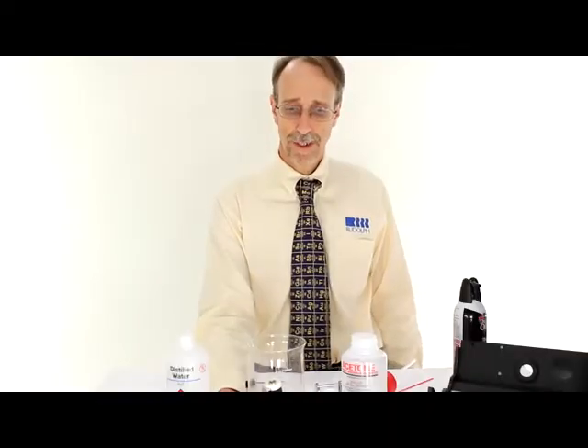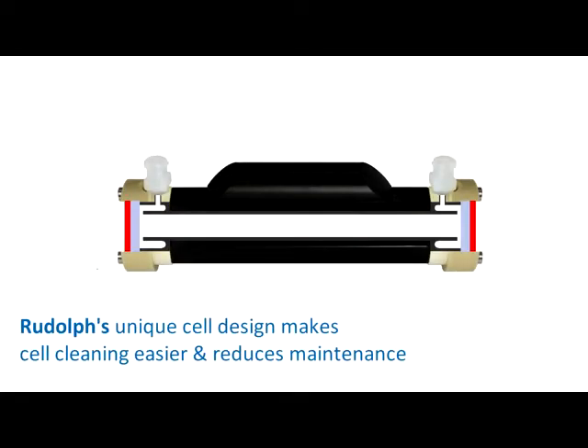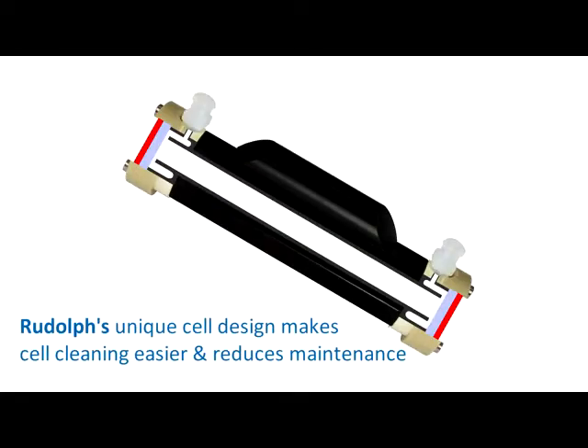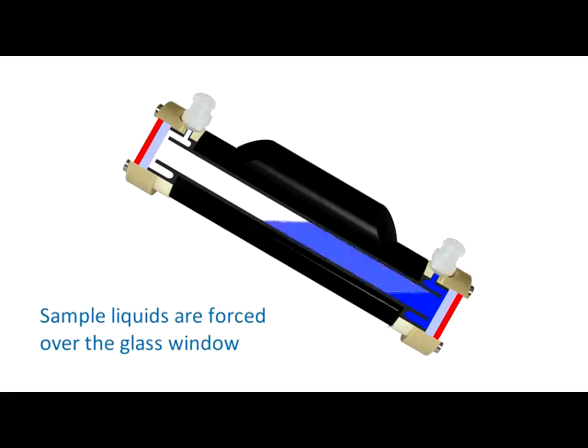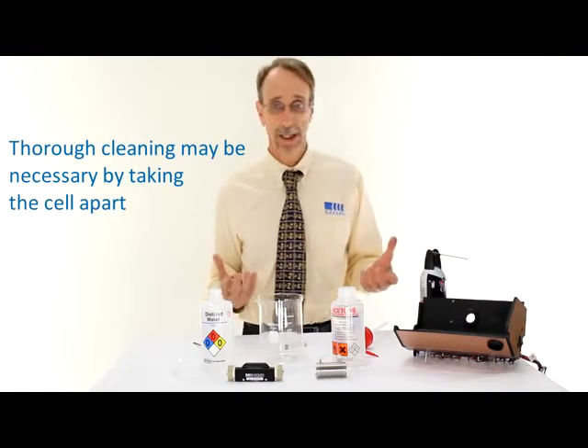In normal circumstances, the cleaning done should be enough. I've left the cell intact, and this is because of Rudolf's special cell design. The cell is a double annulus whereby water coming in is directed from the center to the outer part of the cell, where it washes the glass window, then back down the center of the cell again. This next section shows how to pull the cell apart and provide a thorough cleaning if the simple cleaning does not suffice.